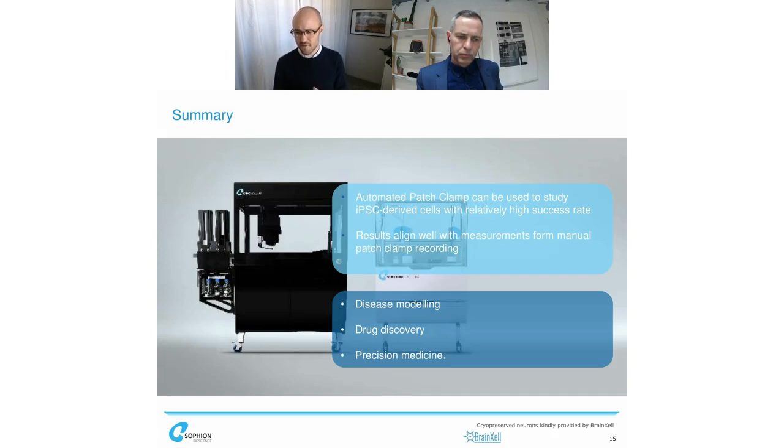But here, after this process of lifting, although I don't have very hard numbers where we've looked at that ratio with statistics, it was the vast majority of the cells that we have successfully recorded, meaning they had the capacitance and resistance threshold exceeded. I would need to look it up in detail, but it was somewhere in the 75-80% range of the successfully recorded ones. And presumably most of the other cells would have been glia, or other potential cell types? There might be progenitor cells, but glia cells, yes, is probably something. I think that might also be a follow-up for Mike, who has a more precise answer to that.